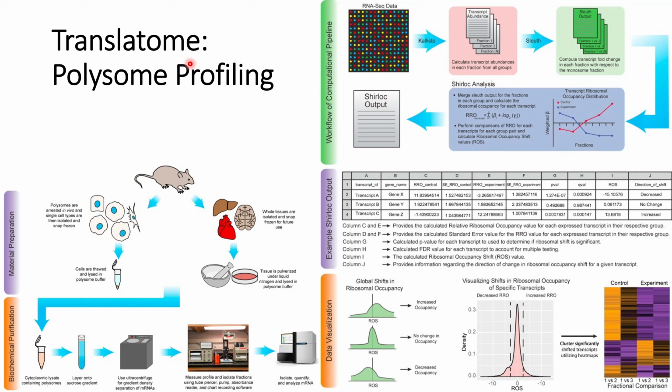In this video, we will continue our discussion about polysome profiling. In the previous video, we discussed different methods that were initially used to compute the translatome. This translatome means the mRNA that are being translated within the samples. So let us start with the material preparation.